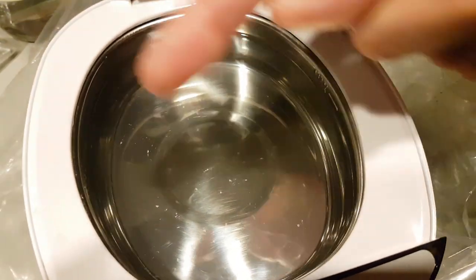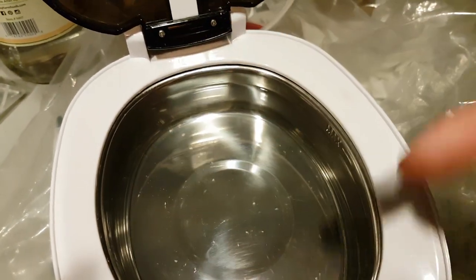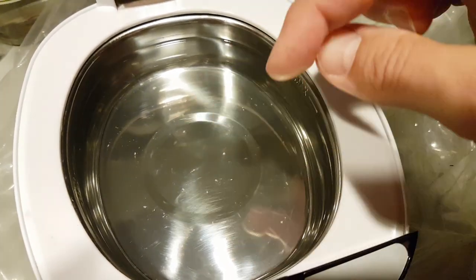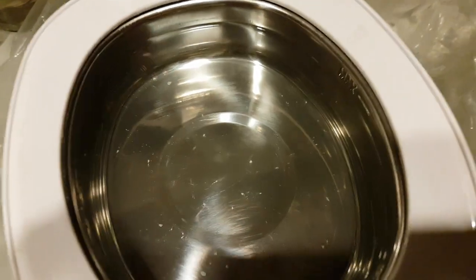If you can imagine, sound is bouncing around here and around here and around here. These are areas, given this particular system, where there are resonant areas where you have wave interference and maxima producing the cavitation.